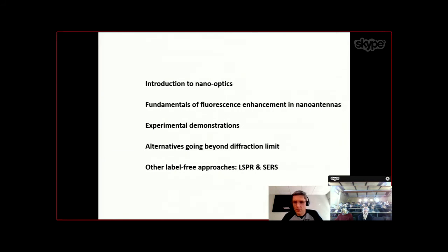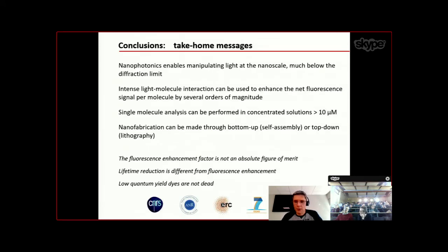I promised that we'll take you through all this. Nano-optics, enhancements, demonstration, how-to, alternatives. We will discuss that in an alternative talk. So my take-home message is nanophotonics is now mature enough. Okay, it's a way that allows you quite easily to manipulate light at a scale that is below the wavelength. Okay, so the diffraction limit is no longer a limit. You can concentrate light on a nanospot, okay, down to the size of the molecule, typically. So with that, you can increase significantly the fluorescence per molecule.